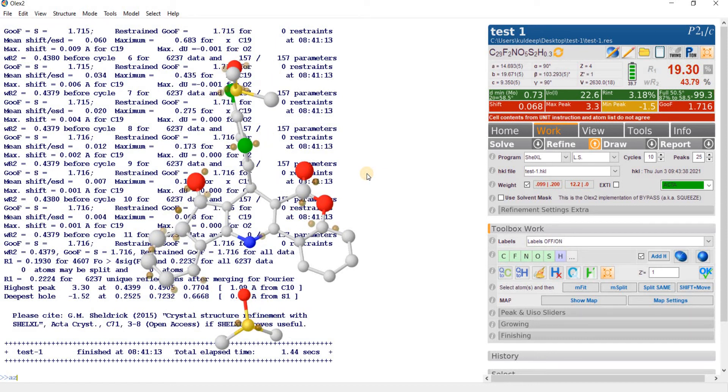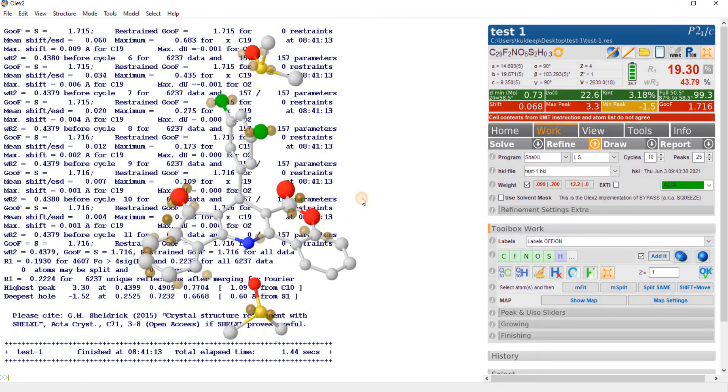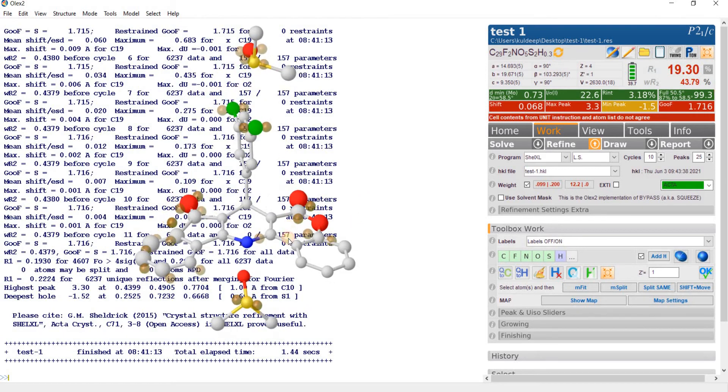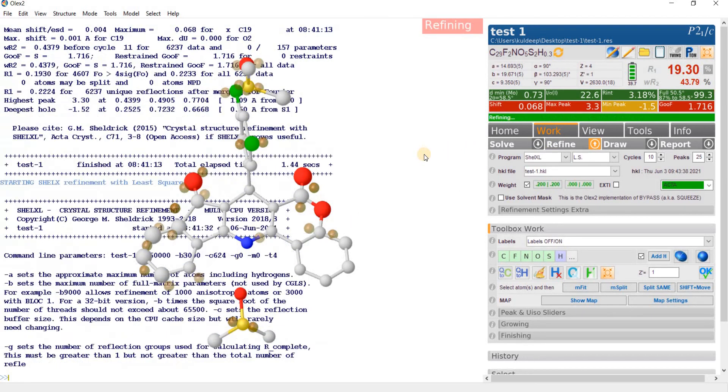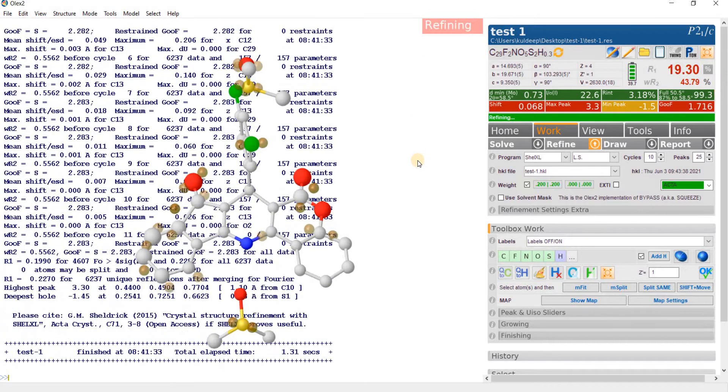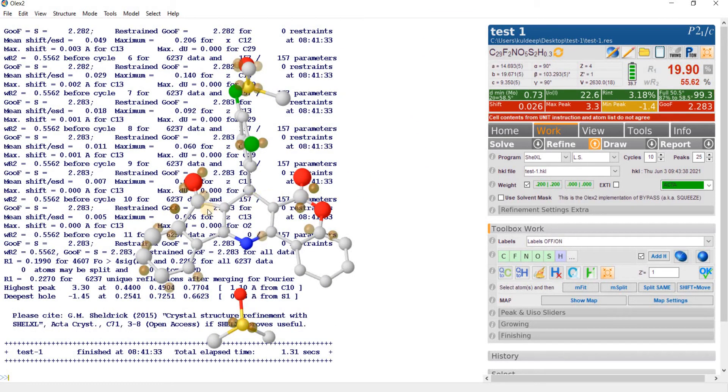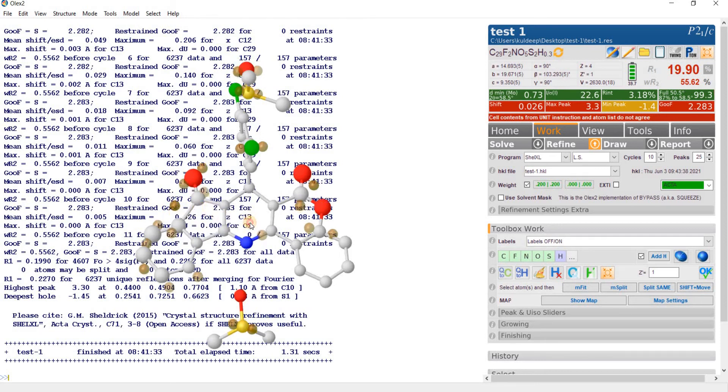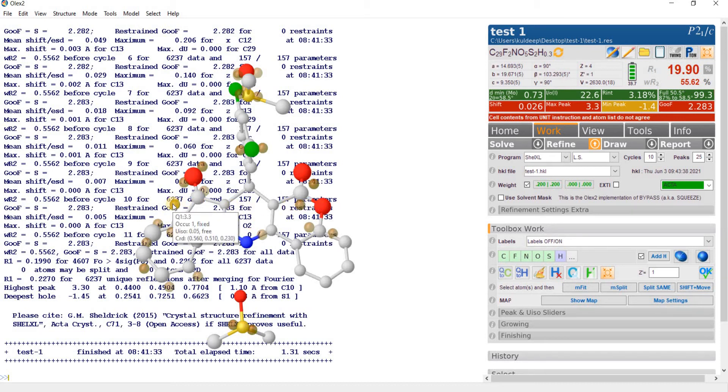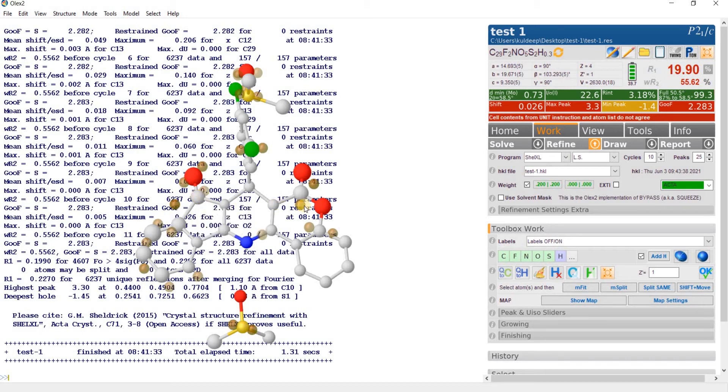If you carefully look at the Q peak intensity, you are getting a number of Q peaks around the 5 and the 6 member ring. If you carefully observe the highest Q peak Q1, then you will find that this oxygen atom O3 in part is appearing on Q1 and this atom C9 in part is appearing on the Q peak Q9.